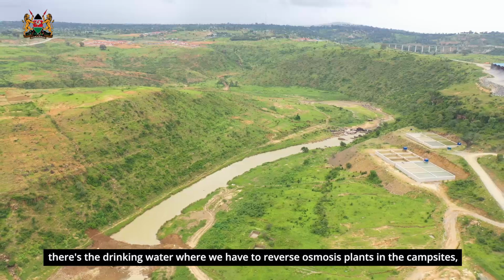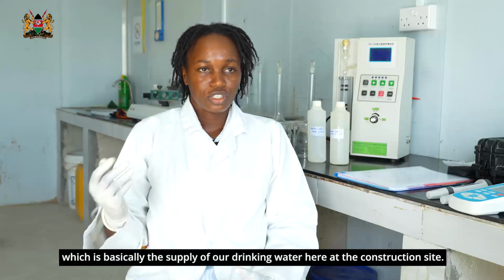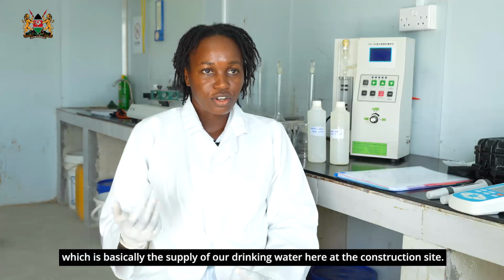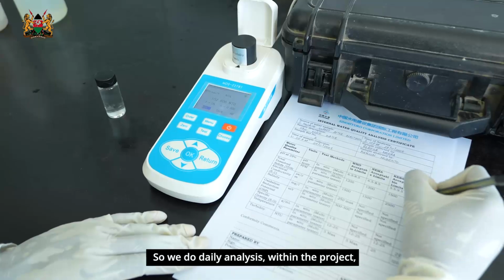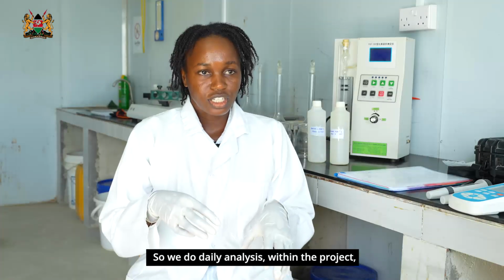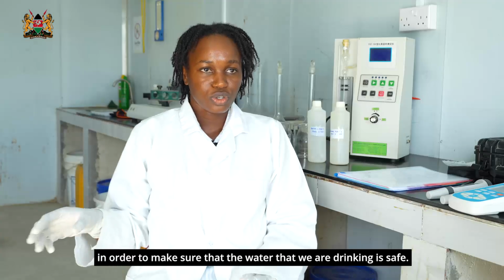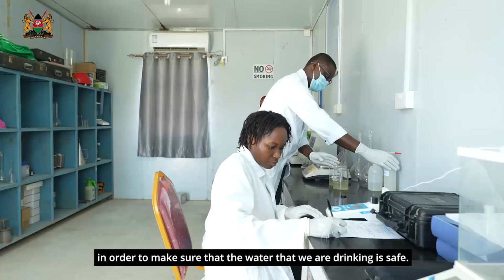There's the drinking water, where we have two reverse osmosis plants in the campsites, which is basically the supply of our drinking water here at the construction site. So we do daily analysis within the project. Then there's the quarterly, where we have to do a comprehensive analysis in order to make sure that the water that we are drinking is safe.